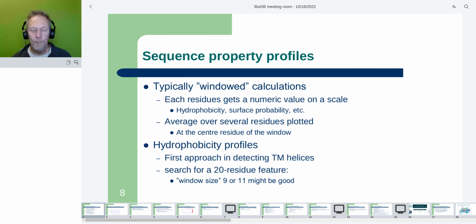In the same way, if we look at things like hydrophobicity, the non-polarity of amino acids, they go back and forth. Usually it's common to see that every second amino acid might be hydrophilic, every second hydrophobic, but for a better trend of a hydrophobicity profile, you take a window of say 11 amino acids and calculate the average of that.